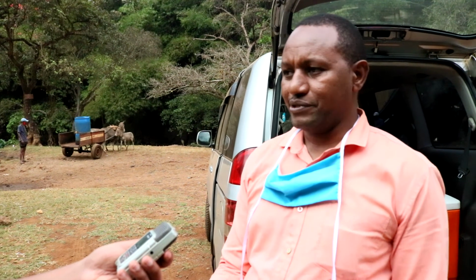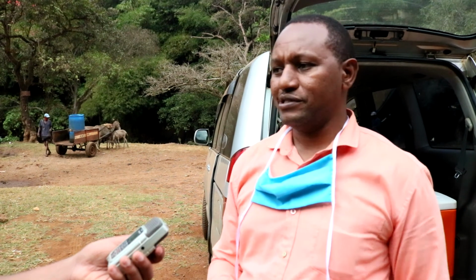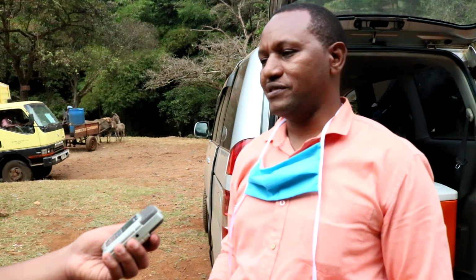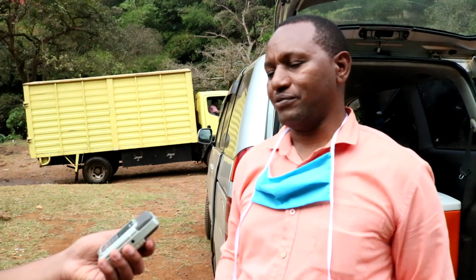And we are going to transport this sample all the way to Crop Nuts laboratories so that we can get testing and get the results of the maximum residue levels or MRLs, or the chemicals which are inside these samples. So that is the next step of what we are going to do now.